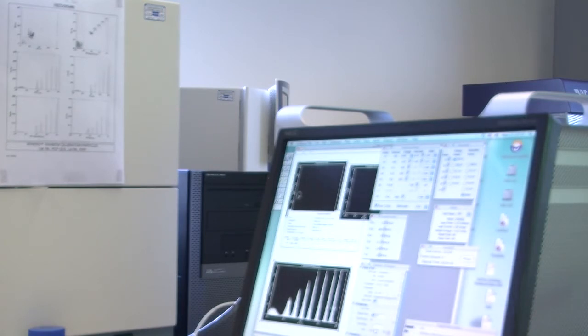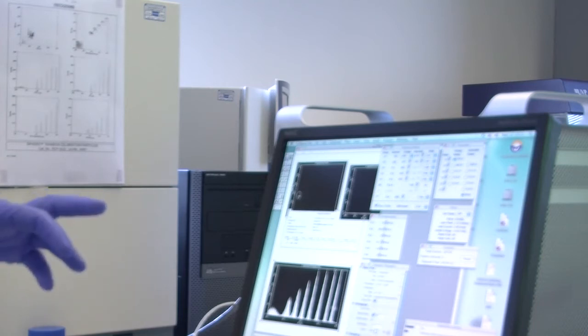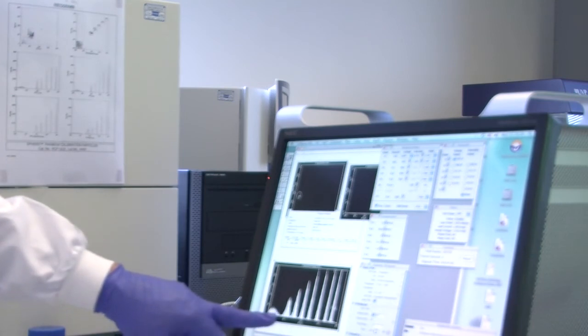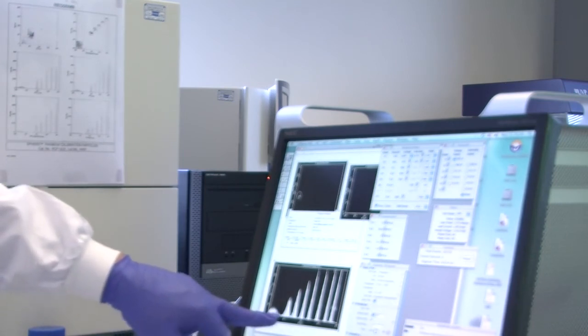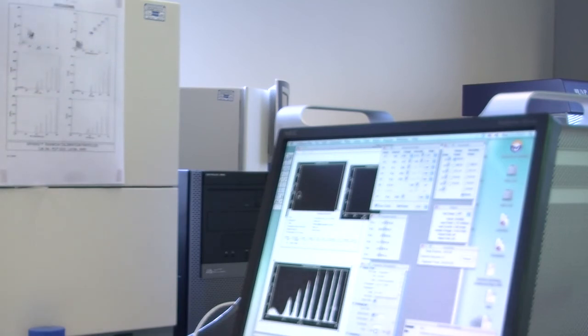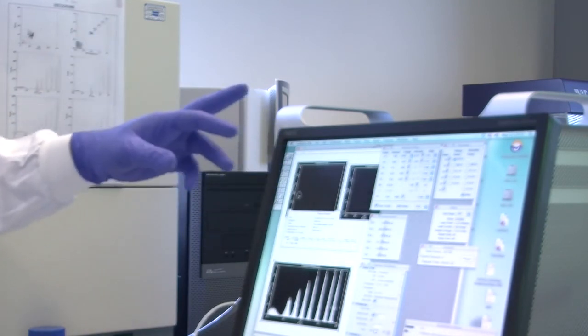Okay? Yeah. I'll go back to the median. Does it take into account the population? So the shorter peak is on the left-hand side. Yeah. It might have less brightness, but has a bigger population. Yeah, so the spread of it is called the CV, coefficient of variation. That's how wide the peak is. It's the variability. The median is how bright the population is as a whole, and the percentage is also important.